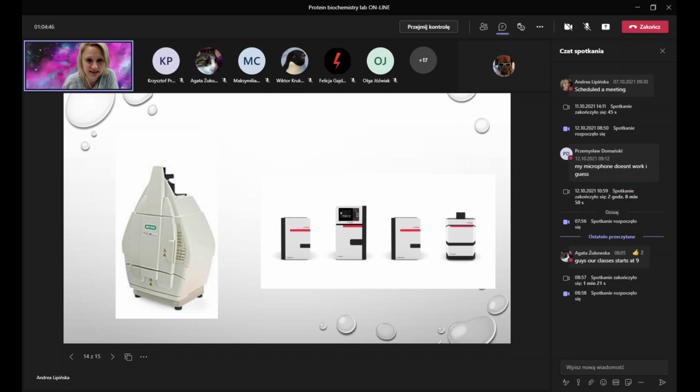And then Western blotting, this is the incubation with antibodies. So this is detection with antibodies. Usually, this is a two-step incubation. We have primary antibodies and secondary antibodies. This is usually because of money. Buying antibodies directly conjugated with an enzyme is a bit more expensive, because unconjugated primary antibodies can be used for different methods.